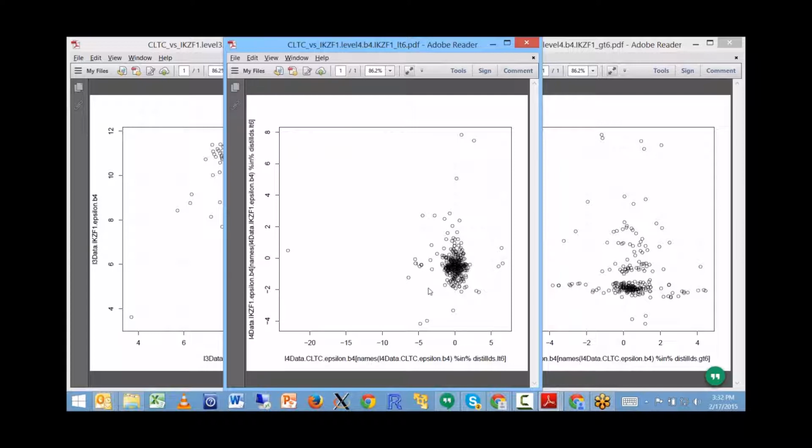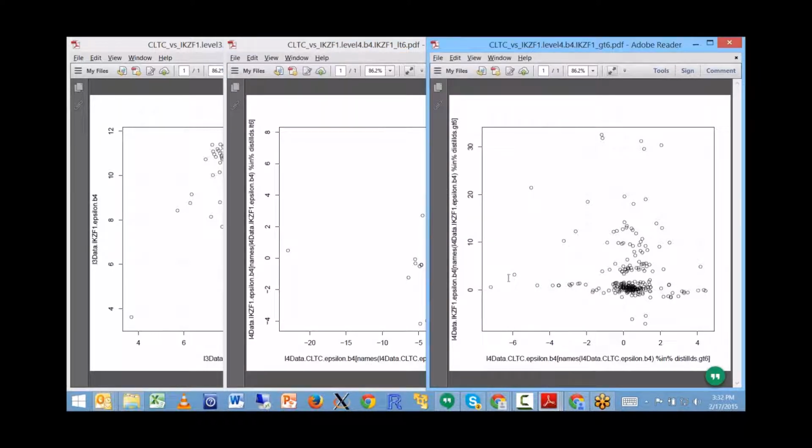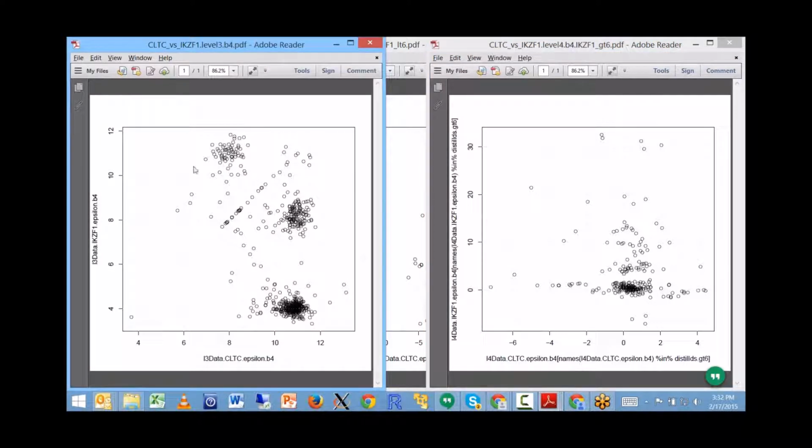And the other one, this is the cluster that corresponds to the other group here. And if you think of the theory, which ones should create outliers for the gene on the y-axis, it would be this cluster, right? Because these clusters have nothing to do really with the observations for this gene. They're just kind of split observations for the gene on the x-axis.